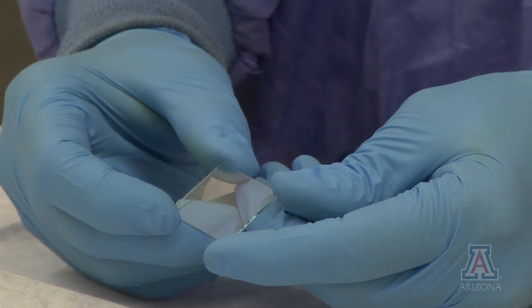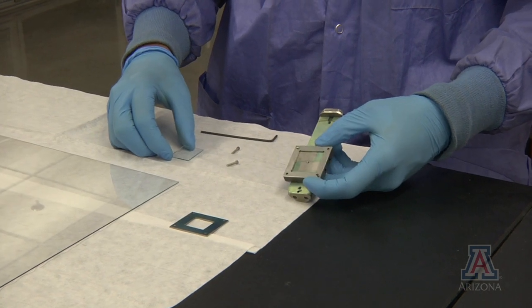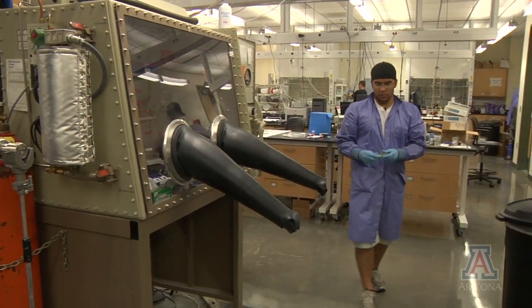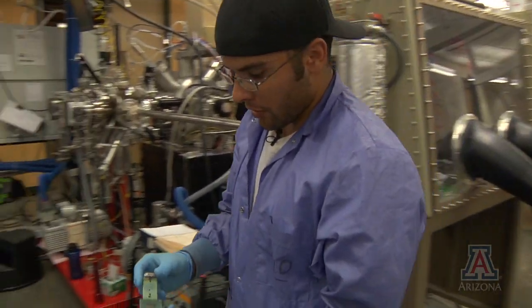After the transparent conductor is created, it is then cut down to a 1 inch by 1 inch square and placed into a boat assembly. Now that we've got our transparent conductor in its boat assembly, we're ready to load this into the vacuum system.